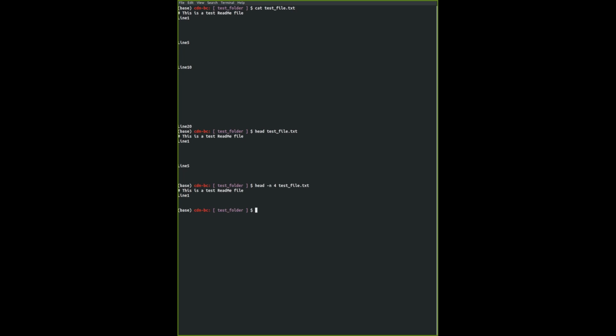Okay, I'm going to clear the screen again, and we're going to go through the last part. It's a very small, very useful part before we go for a break. We will have a break. It's not fair if I don't give you a break, and it's also good for learning to have a short rest. So the last part is to delete files and folders.